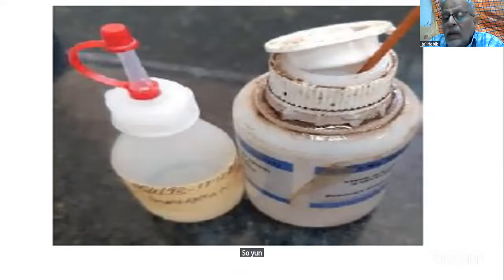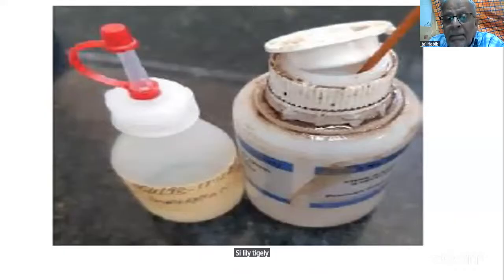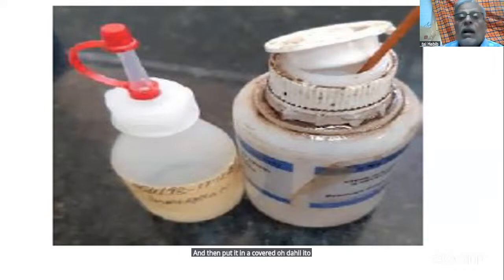So if you are in areas like Mombasa, a coastal area, you have to cover the microscope with its cover, then put another garbage bag on it, plastic, seal it tightly, and then put it in a cupboard. Otherwise, it will not last. Thank you for reminding me that.